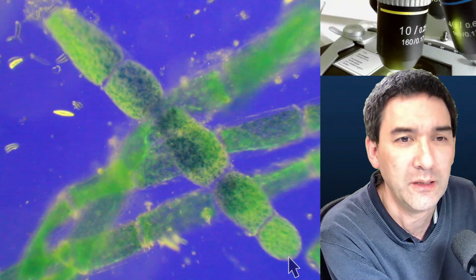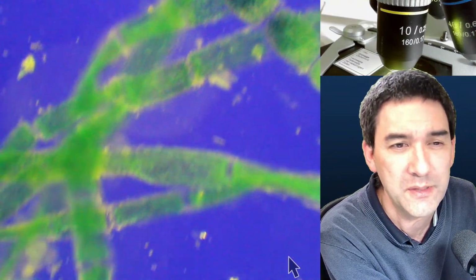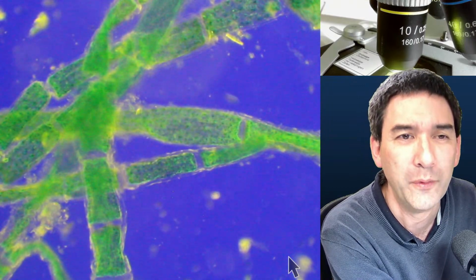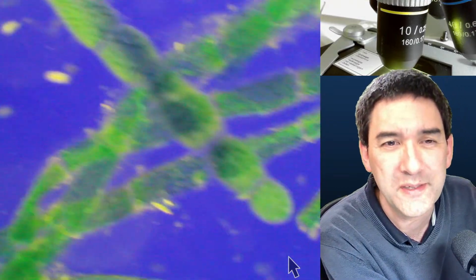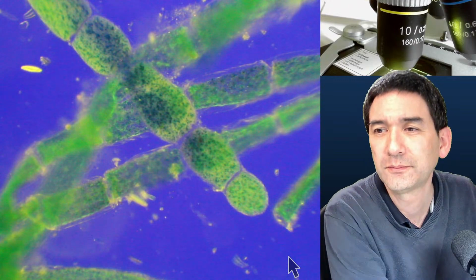I have done a little bit of dark field microscopy and also a Rheinberg with 40 times, but this is really kind of stretching it already. Then you have to go up with the exposure time so much or with the gain, and the image quality drops again.